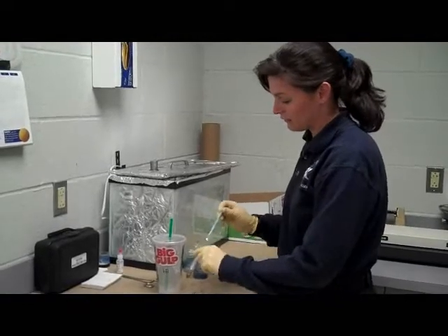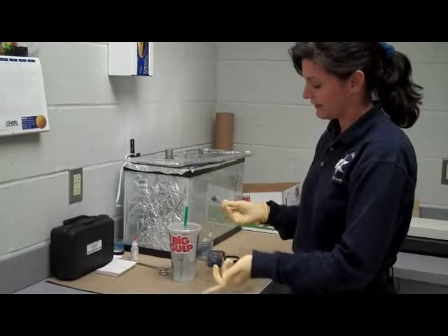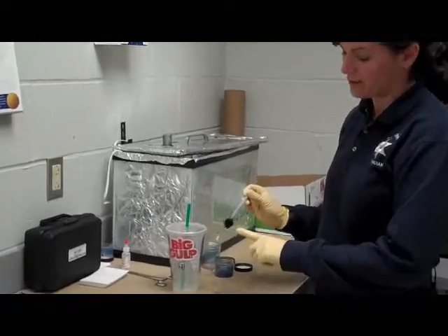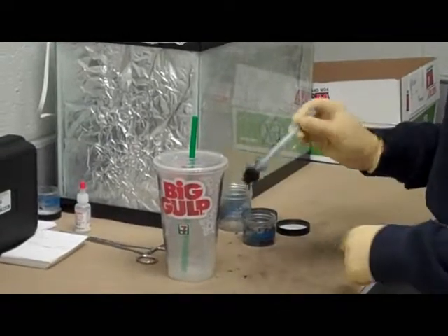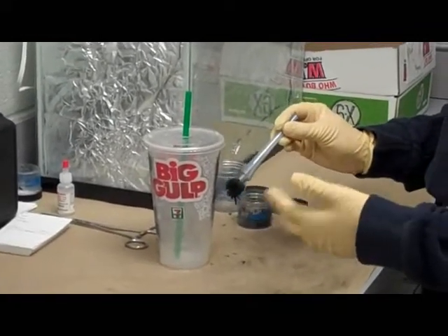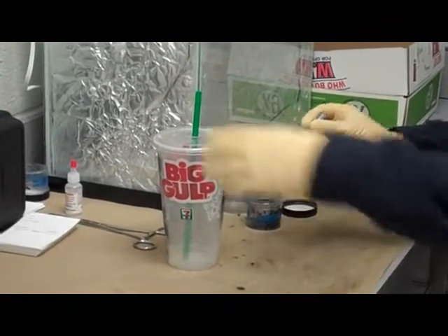They're very easy to use. It's basically just a magnet on a wand inside of a plastic casing. You just dip the magnetic wand into the powder, and the powder's magnetized, so the powder itself becomes the bristles of the brush. The theory is only the brush is touching the object you're trying to print, so there's less chance of wiping away a print or damaging the print in any way.